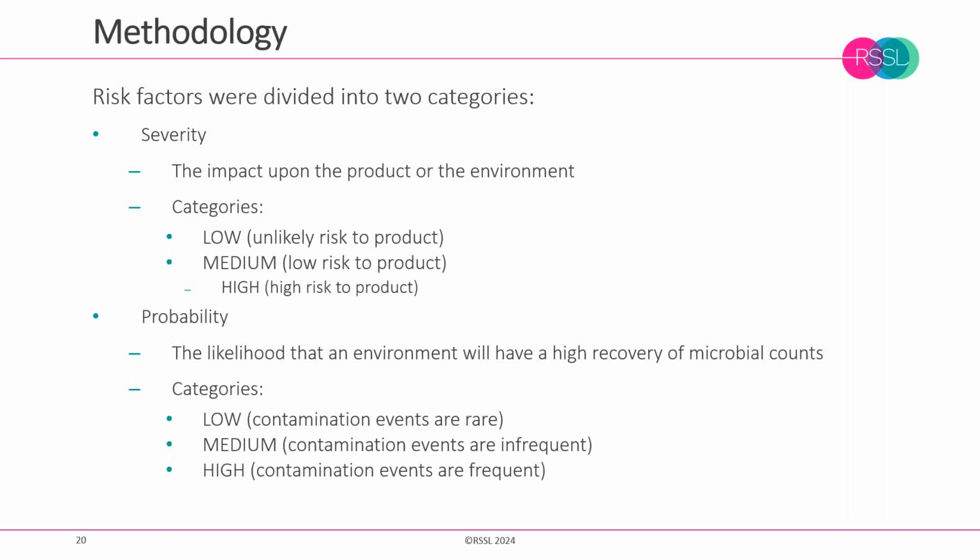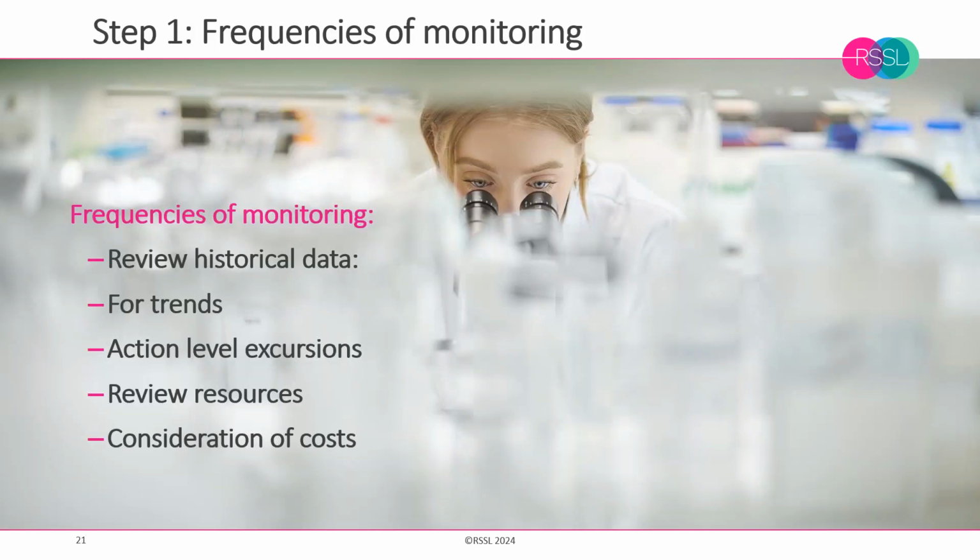So with the risk identification process, there are actually around 10 risk factors that we're going to look at. Once we've gone through those, we then look at a risk ranking. So that's how important are the risks relative to each other, and risk filtering is how we can evaluate these different risks.